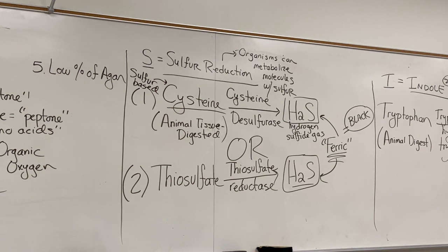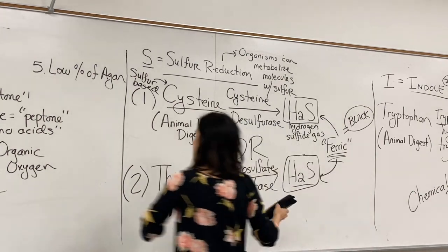So indole is probably not anything particularly helpful for the bacteria, but it's kind of a byproduct. So all you guys are going to do is you're just going to dump in a chemical and you're going to label the indole. So that'll be a pretty straightforward part of the test. Just kind of pour on the chemical. So I'll tell you guys how to do that.